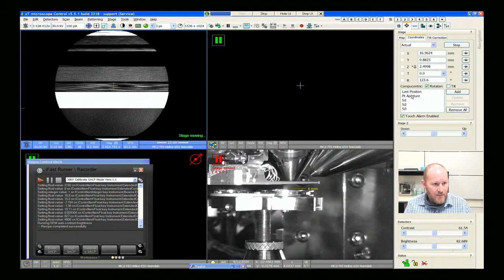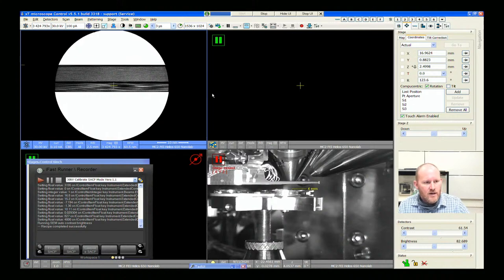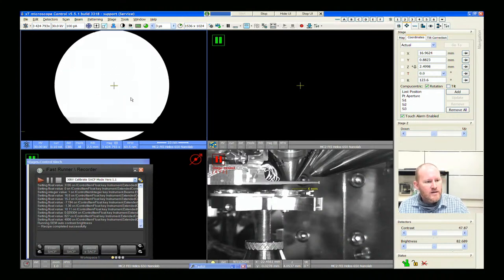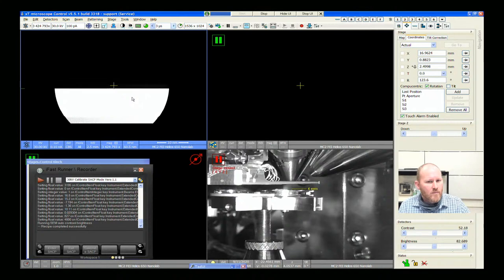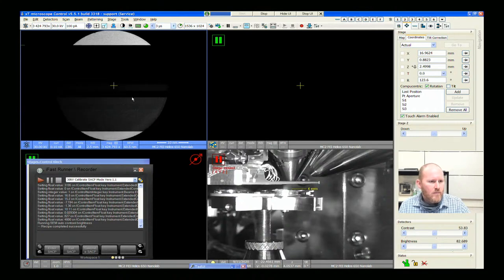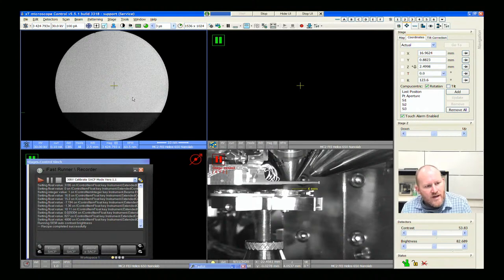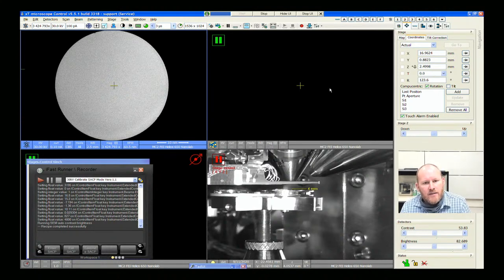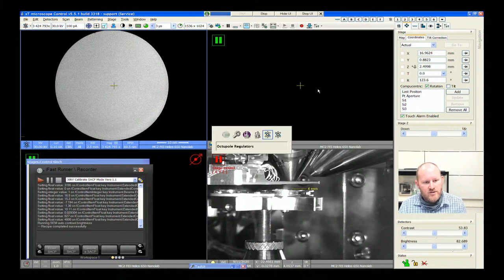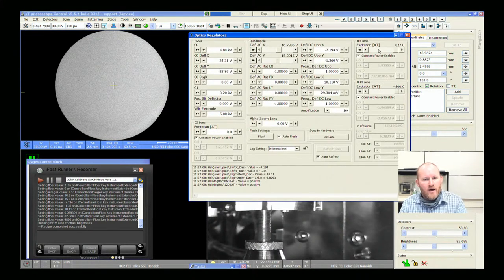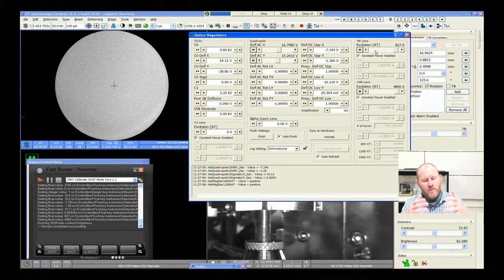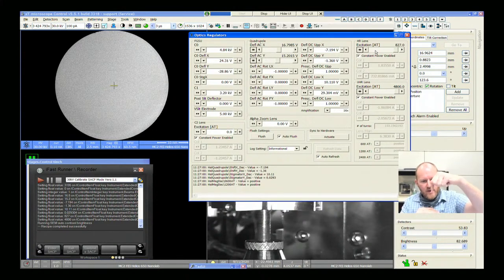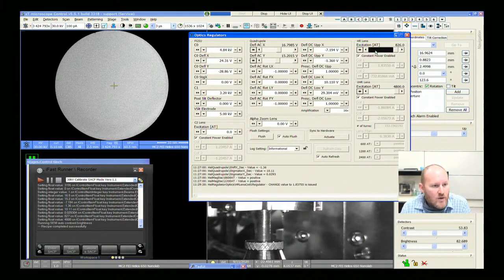Let me go to the platinum aperture to see if we get lucky there — that should channel pretty brightly. Of course that sample was not at the right position. What that means is that we're going to have to change our HR excitation. The sample was farther down, which means that we need to relax the HR lens a little bit. The pivot point will be above the sample — if we relax the beam, we'll drop the pivot point down.